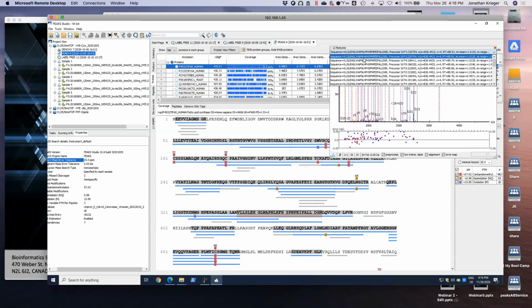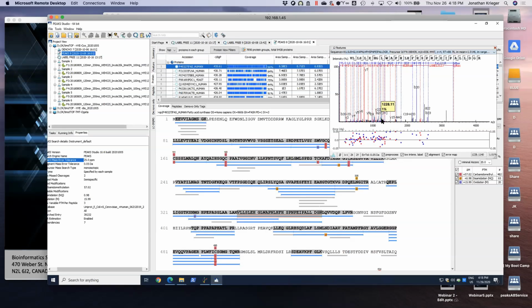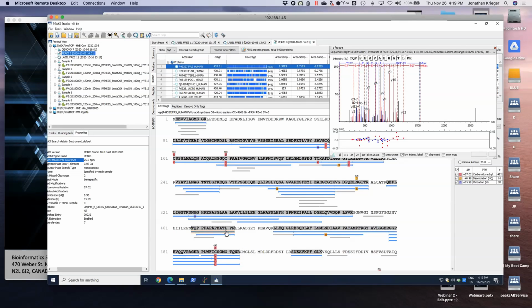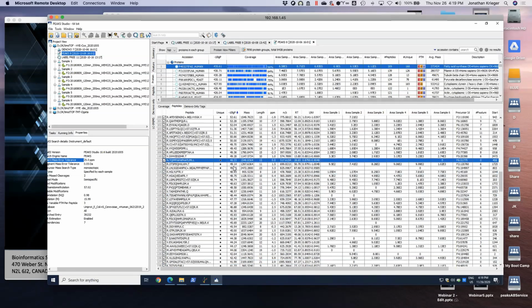You can of course drop that down and view any of those features that sequence out to that peptide. Now, if you want to interrogate your peptides a bit more, which I always encourage people to do, if there's a particular peptide you want, you can right-click on the peptide and click Show in Table, and it will pull you into the peptide table.